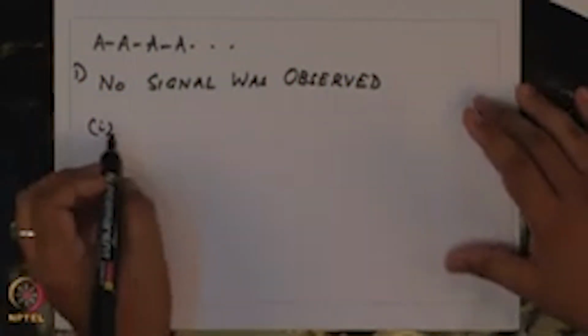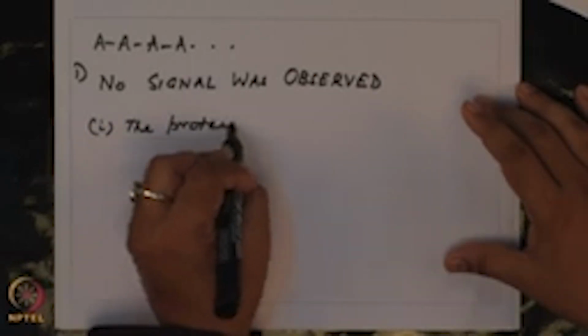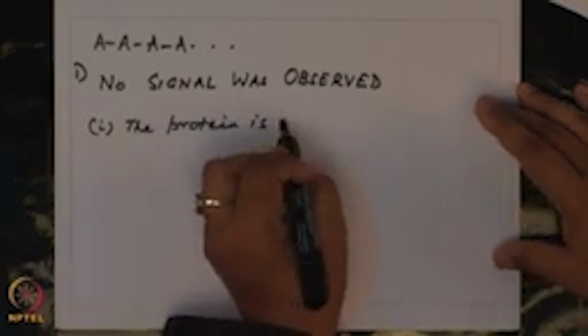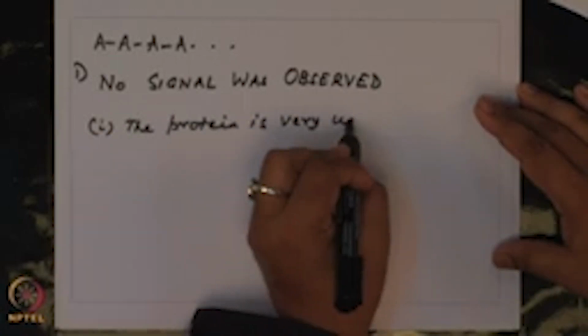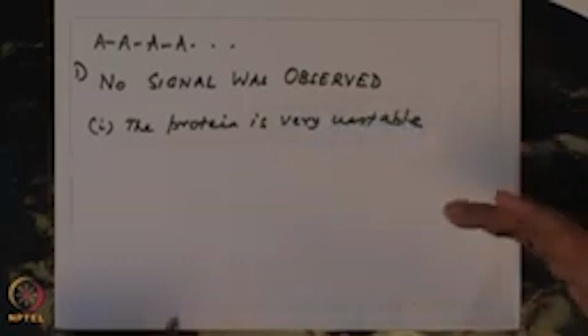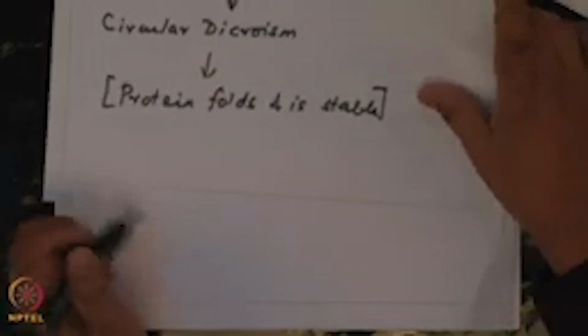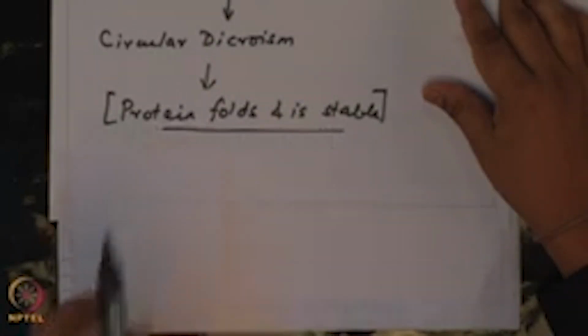So in this particular case, what might be the possibilities? One possibility is that the protein is very unstable. To begin with, it does not fold properly, and that is why I said we must make sure that the protein folds and is stable.